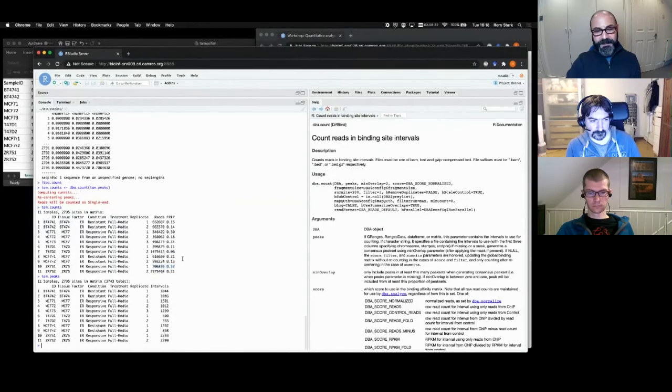Now, what accounts for these numbers, and what numbers do you expect? If you go look at ChIP-QC, there's some QC to look at what you should expect for enrichment. We compare it to a control. In the control, you should have very low enrichment. But in a ChIP or an ATAC, they should be above 0.1. I would say that's not a fantastic replicate, but that's okay. That's why we do replicates. And it can go up to 0.5, 0.6, particularly in ATAC, where I think we see higher numbers.